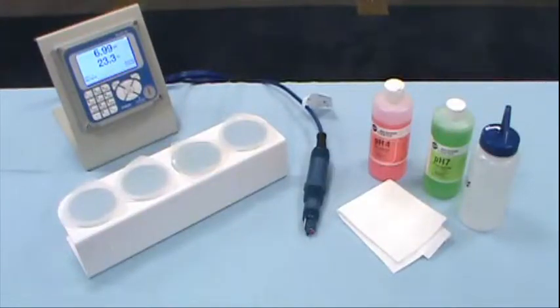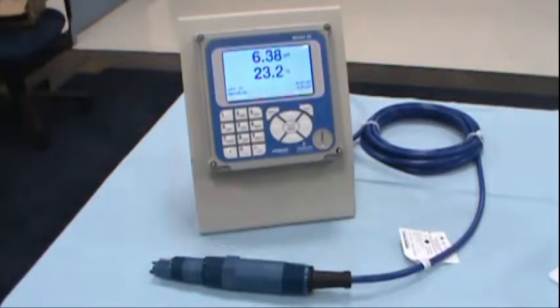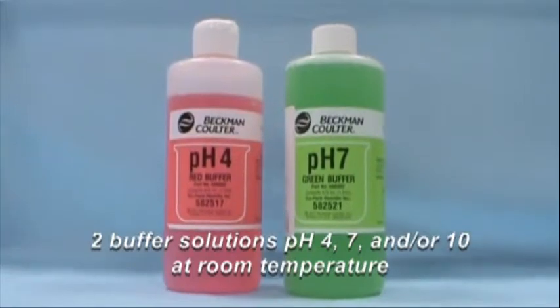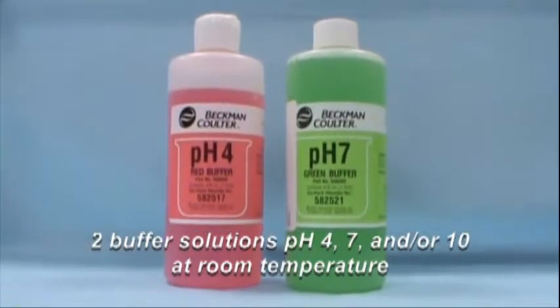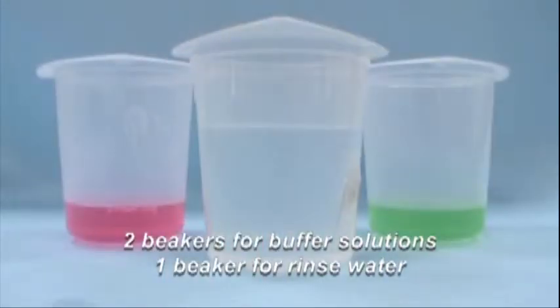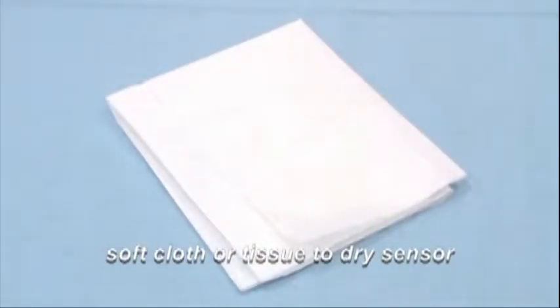To calibrate the sensor, you will need the following: a pH sensor, a pH instrument, two buffer solutions — pH 4, 7, and/or 10 — at room temperature, two beakers for buffer solutions, a beaker for rinse water, and a soft cloth or tissue to dry the sensor.